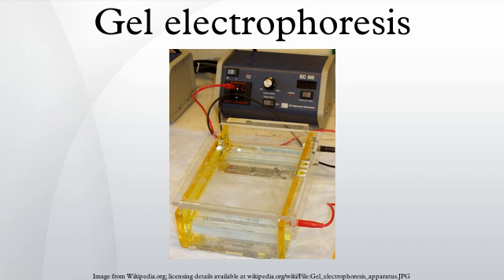Gel electrophoresis uses a gel as an anti-convective medium and/or sieving medium during electrophoresis, the movement of a charged particle in an electrical field. Gels suppress the thermal convection caused by application of the electric field, and can also act as a sieving medium, retarding the passage of molecules. Gels can also simply serve to maintain the finished separation, so that a post-electrophoresis stain can be applied.